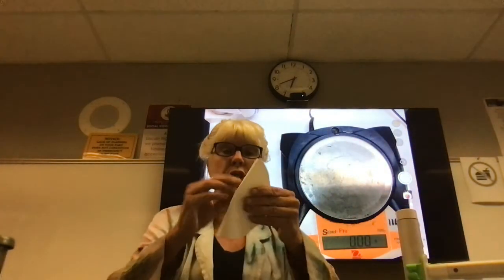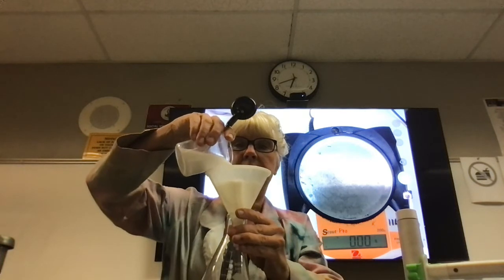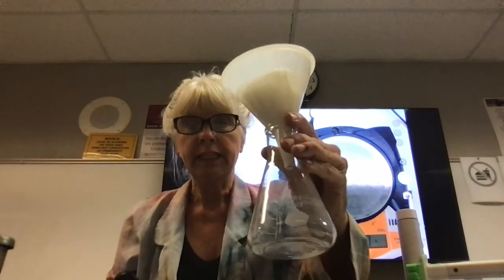And now what we're going to do is we're going to fold it, and we're going to make a little cone. And here's my cone. And now we're going to wet it. We're going to stick it in the funnel right here. And now we're going to filter out the insoluble calcium hydroxide. And you can see that when the filtrate comes out, it's clear, leaving the solid calcium hydroxide behind on the filter paper. We're going to let this filter overnight and let the filter paper and calcium hydroxide dry, and then we'll see what the mass is.